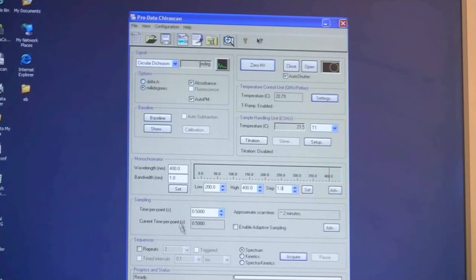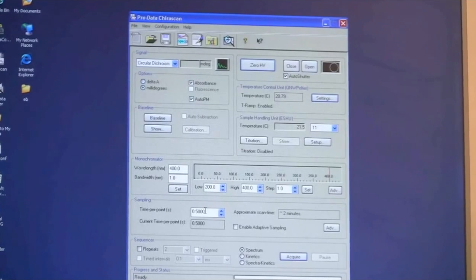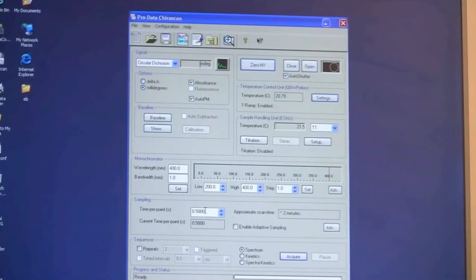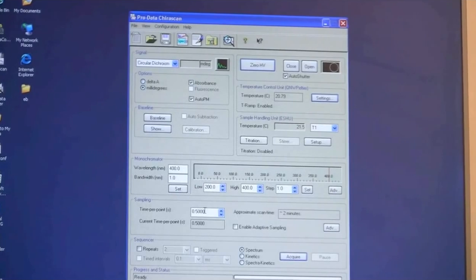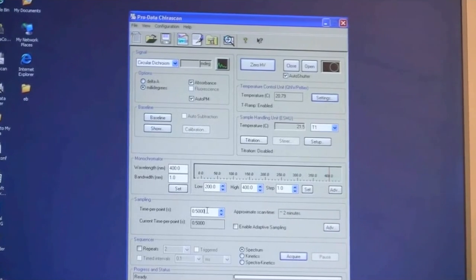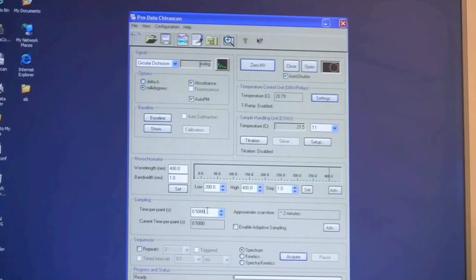Then underneath that there is a time per point. It defines how long time you spend per point you go to on your scan. Typical settings would be somewhere between 0.1 second up to 1 second. It depends on what you are doing.